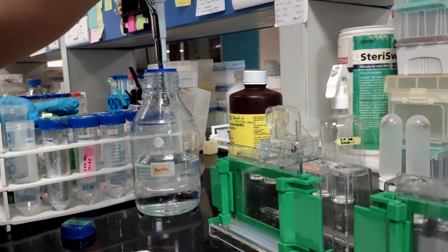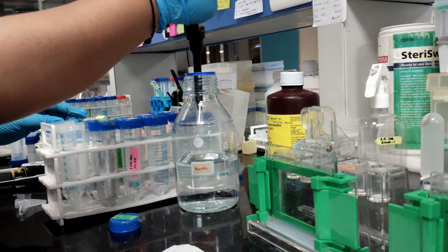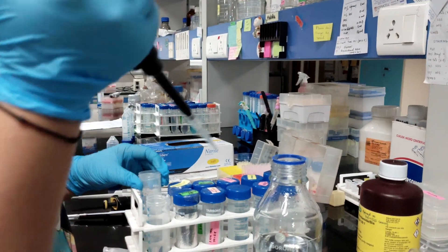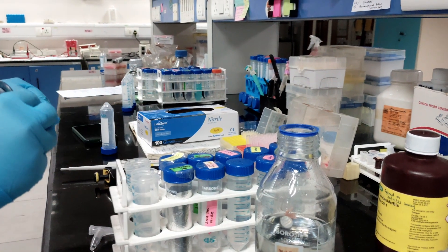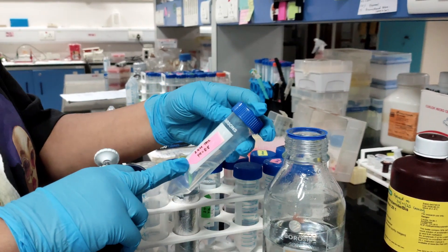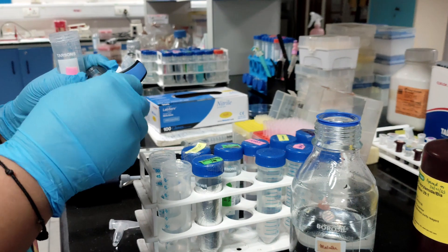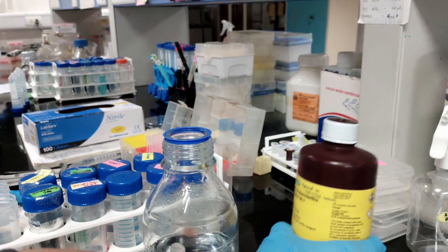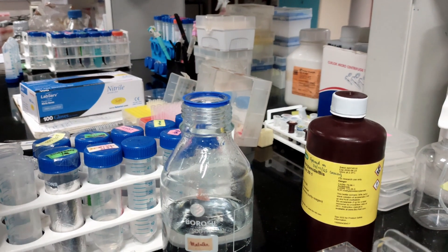Starting with the resolving gel, first we'll add water. Since I'm making two 6% resolving gels, I'll be adding 5.3 ml of water. After adding water, I am adding 1.5 molar Tris at pH 8.8 — we'll add 2.5 ml. The third component is 30% acrylamide; I am using a 29:1 solution and will add 2 ml of acrylamide solution.